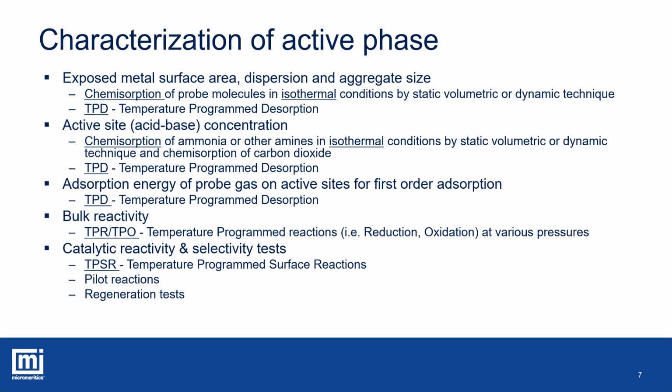Bulk reactivity tests like TPR and TPO require high temperatures to activate also the metal in the bulk. And finally, the reactivity test can qualify the use of a catalyst for a given reaction, permitting the evaluation of activity, selectivity, lifetime. These tests require small-scale pilot reactors.